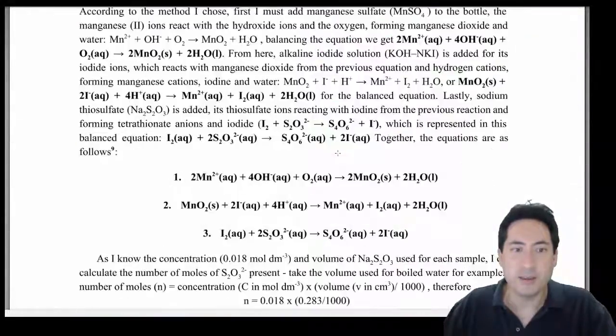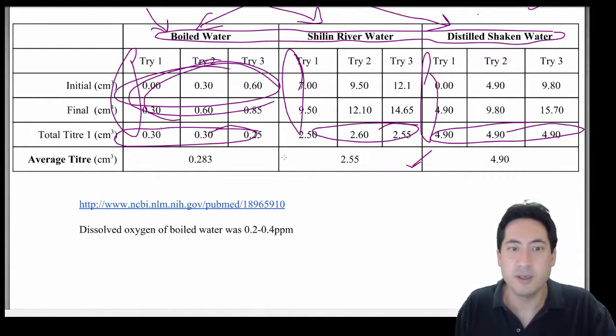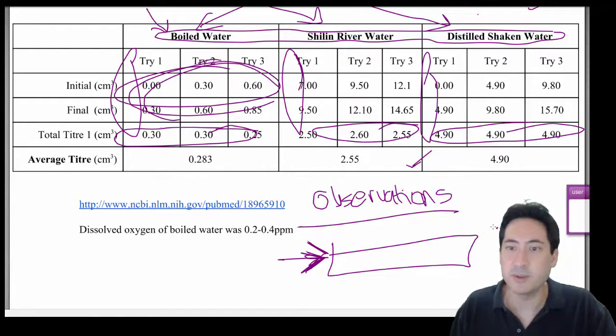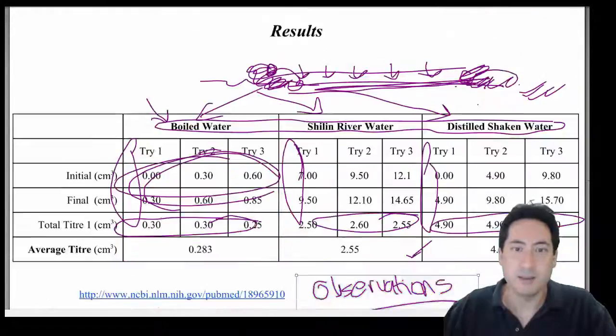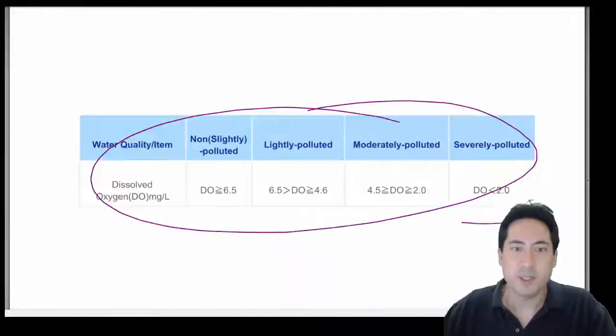And just one other thing is you're not going to get full marks for data collection unless you've got observations. Now, I haven't said this in all of these videos, but I have asked everyone to take photos and videos of what they're doing, so we can easily go back to that if it's missed. I think all of these experiments, especially with colours, are important because there's always weird things going on. So that's another thing that you can add. Apart from that, you're very much on track.